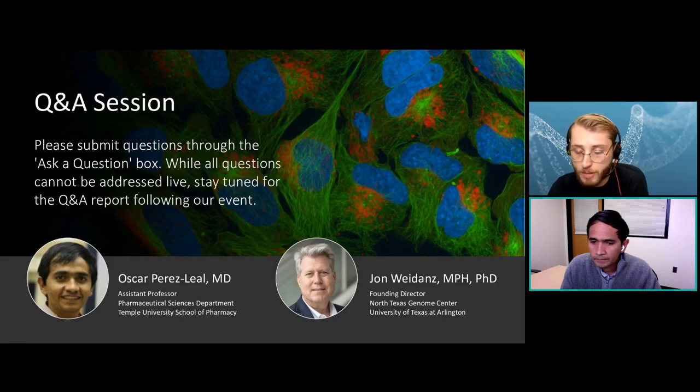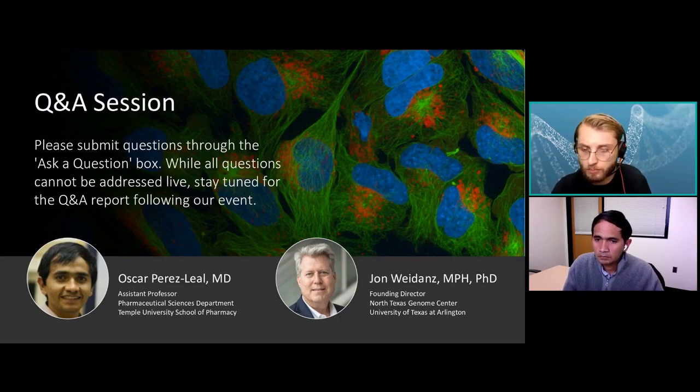Yeah, very good point. And John, what about you? How might you handle that? Yeah, many of the proteins that my group studies are low expressing proteins. And so we do have to treat cells for a number of hours, generally overnight, with different types of cytokines to get the expression level of those proteins increased.